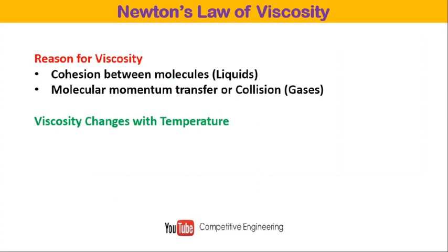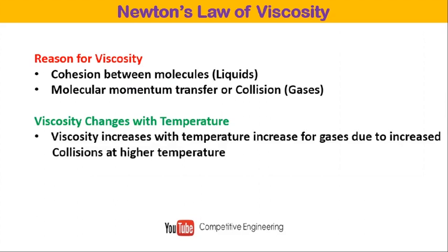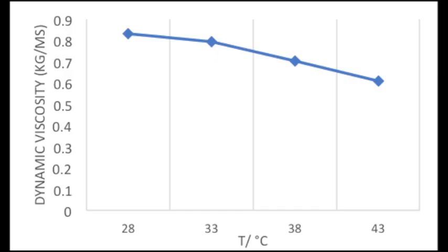The effect of temperature changes in a liquid to the dynamic viscosity was examined. The impact of increasing the temperature in a liquid is to reduce the cohesive forces while simultaneously increasing the rate of molecular interchange. Liquids show a decrease in viscosity with increasing temperature. If your results validated the principles aforementioned, then you did a good job.